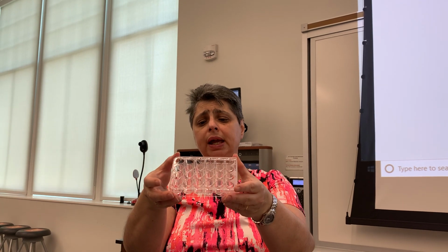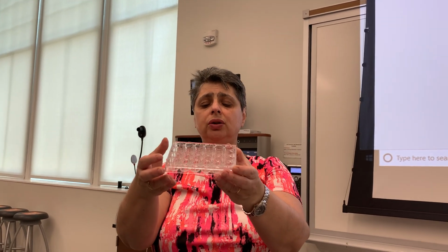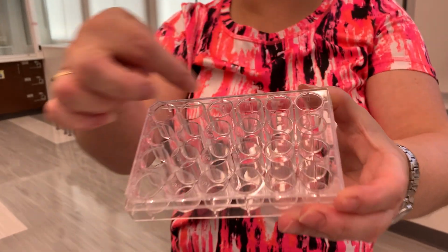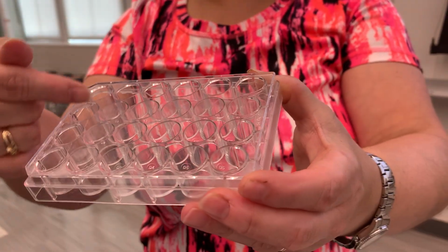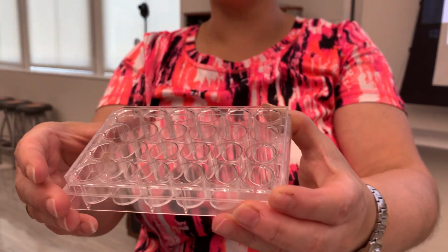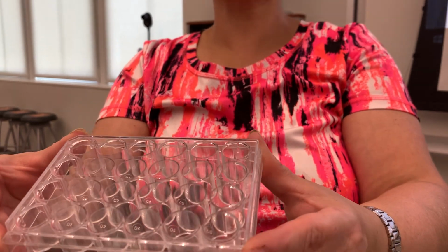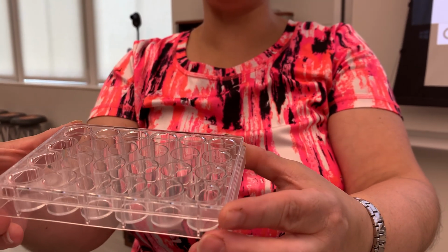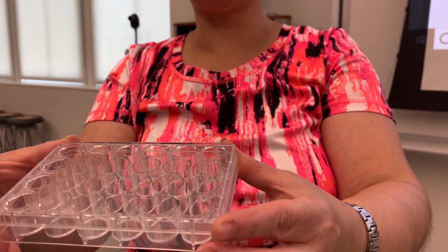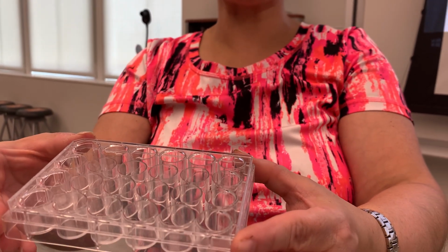This is the well plate you're going to be using to conduct all these reactions. You're going to place your knowns across, and then you test reagents down, each time noting which chemicals you combined in each well and what kind of visual result, such as precipitation or bubbles or formation of gas, you may be able to detect.